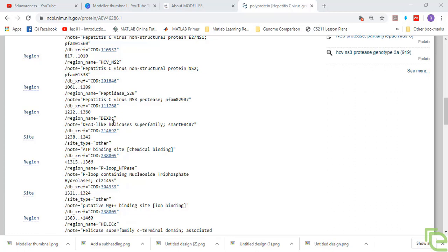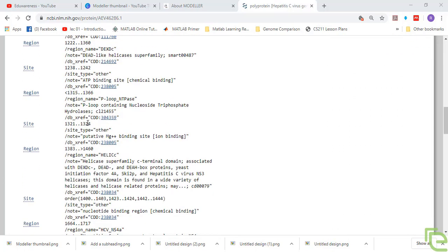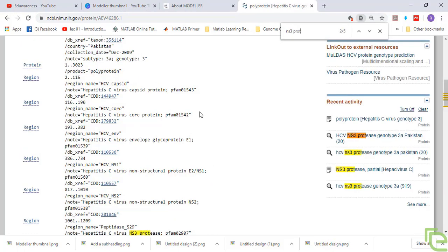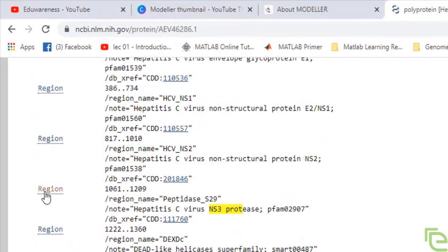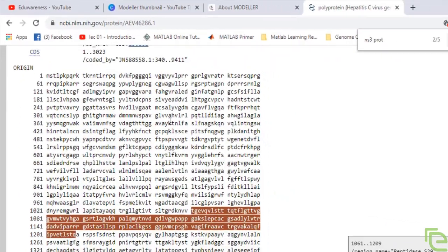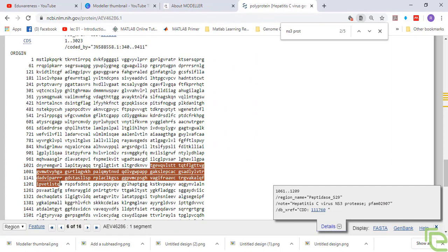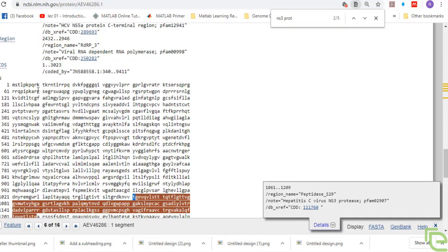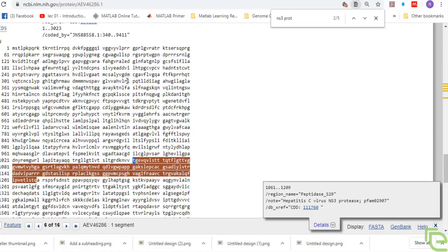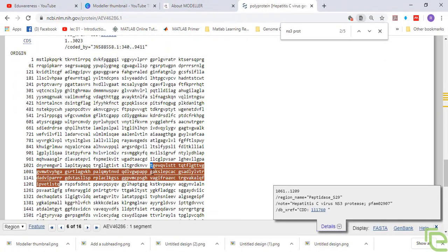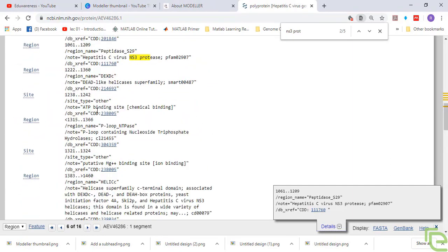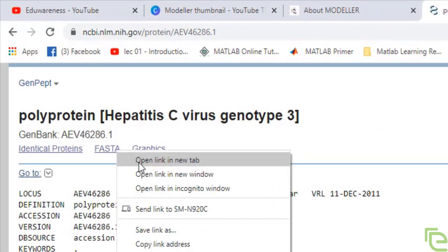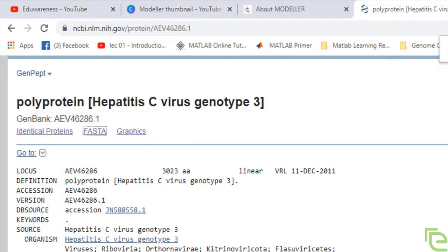If we search NS3 protease, this is the NS3 protease region. From the whole polyprotein, this is the region responsible for its function. We cannot use the whole sequence because it is the whole polyprotein — we only need the highlighted sequence. So we'll save the FASTA sequence of the whole polyprotein.